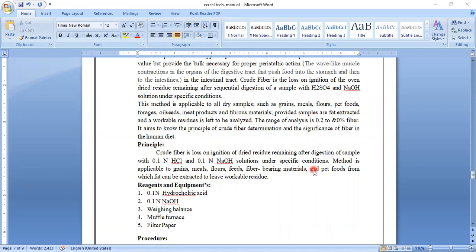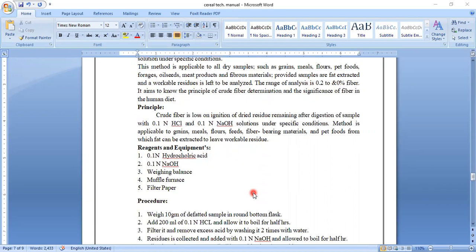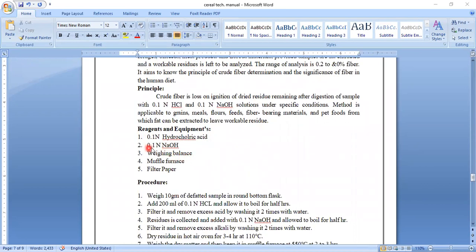This method is applied for all kinds of food products like grains, cereals, pulses, meals, flours, feeds, fiber-bearing materials and pet foods from which fat can be extracted to leave a workable residue. The reagents and equipment required for this experiment are 0.1 normal hydrochloric acid, 0.1 normal NaOH solution, a weighing balance for measuring the required food sample, a muffle furnace, and filter paper.